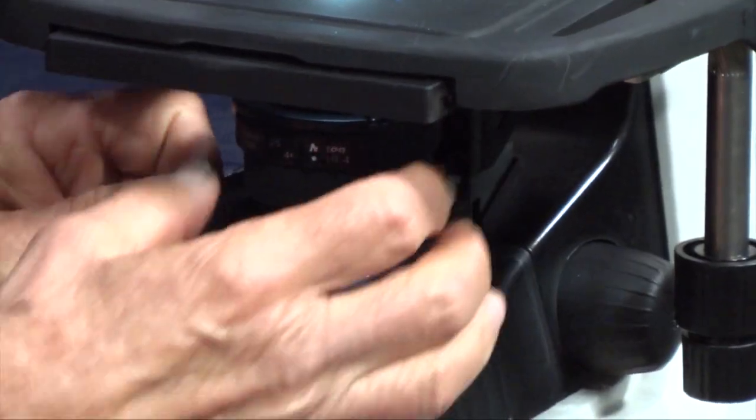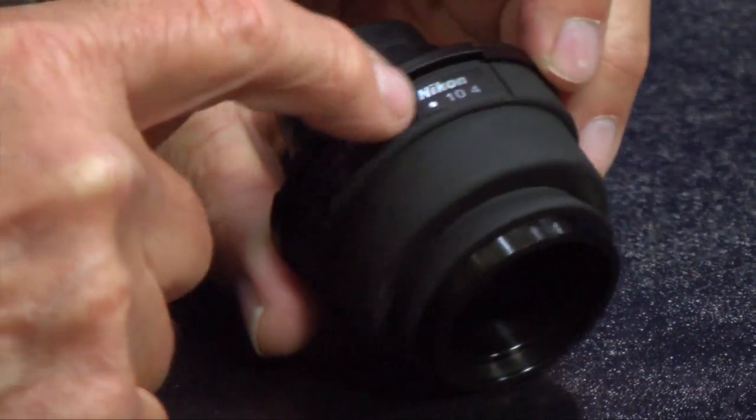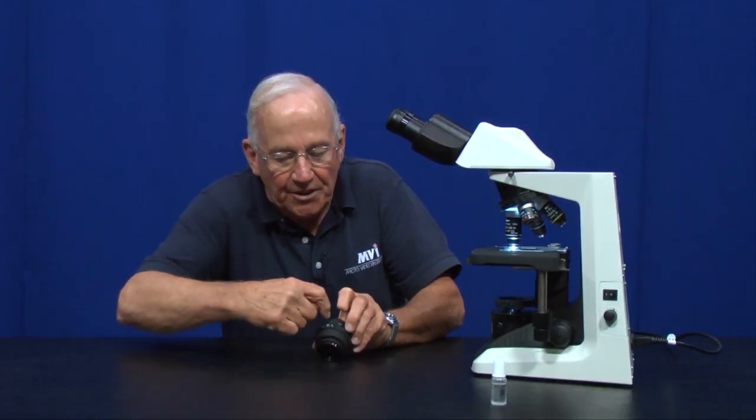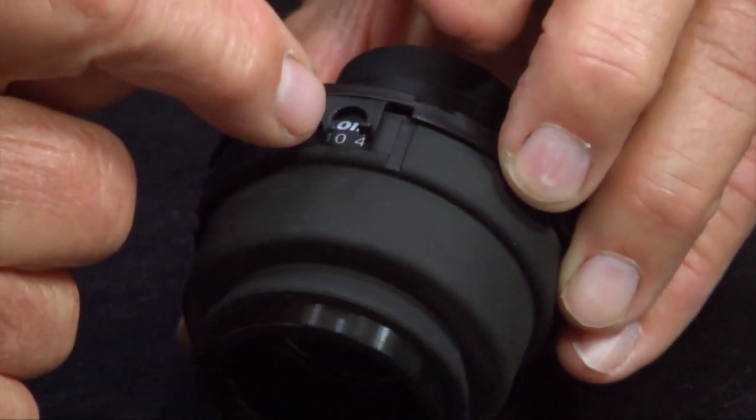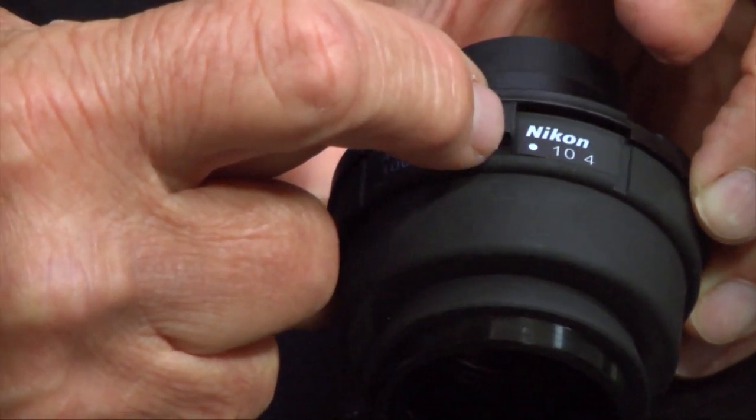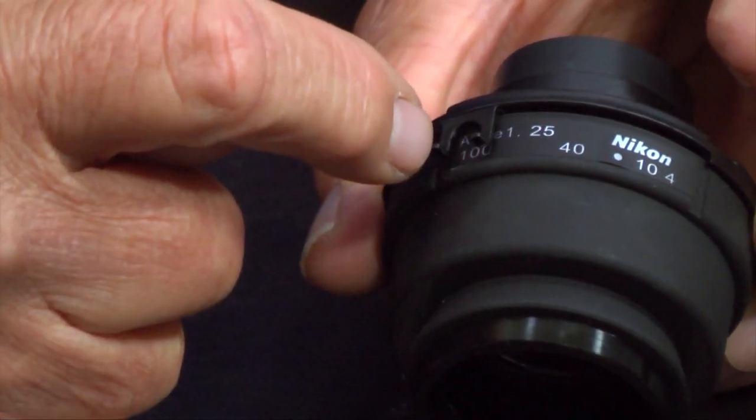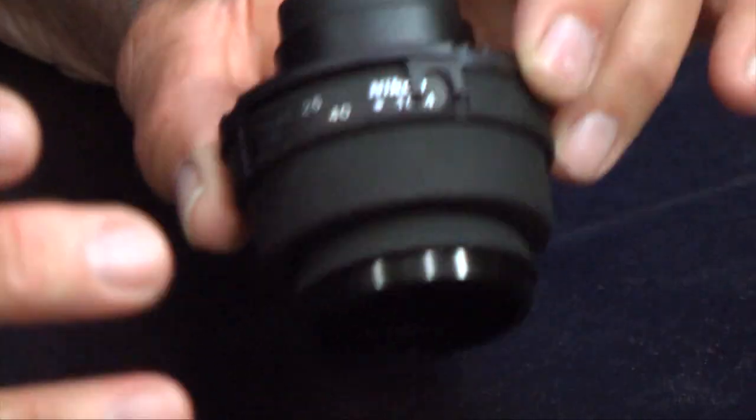I'm going to take the condenser off and just show you what it looks like. The condenser has a numbering system on the front. The numbering system corresponds to the magnification of the objectives. You can read the number 4 there, that's where it should be for the 4x objective. If you went to the 10x objective, you should close it down to number 10. Likewise for the 40x and 100x objectives. When you close that down, it adds contrast to the specimen. They have matched it perfectly to the objective magnification so that you get the optimum contrast for each objective.